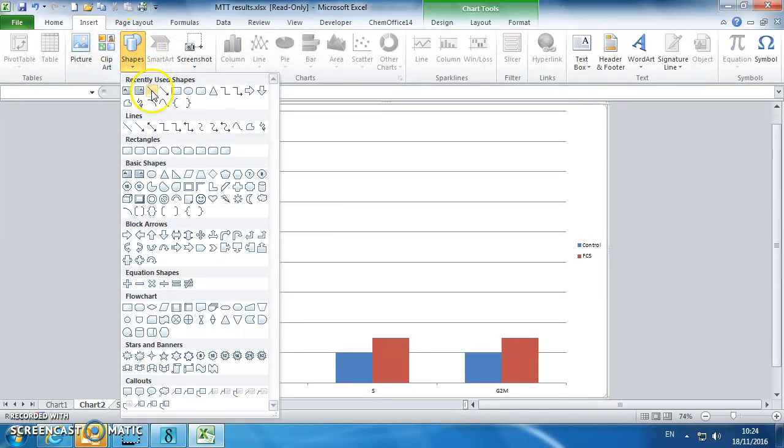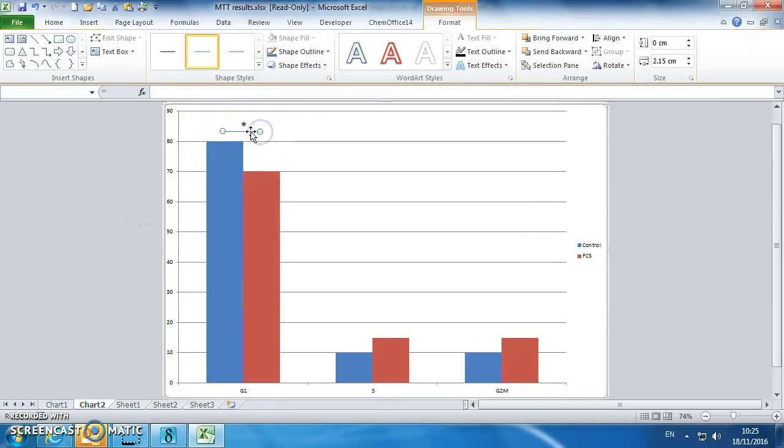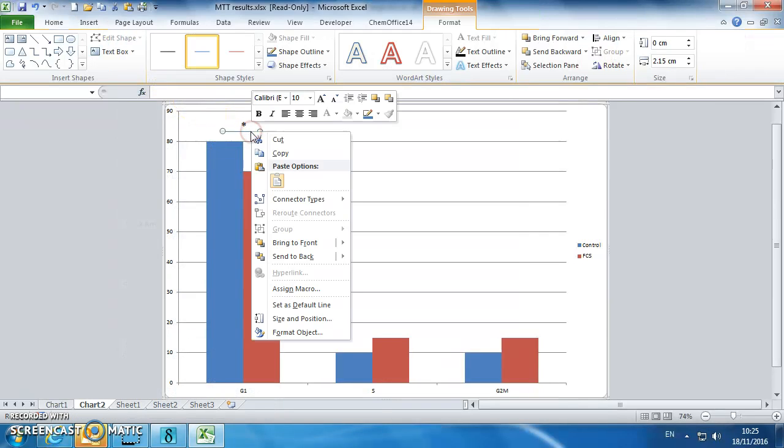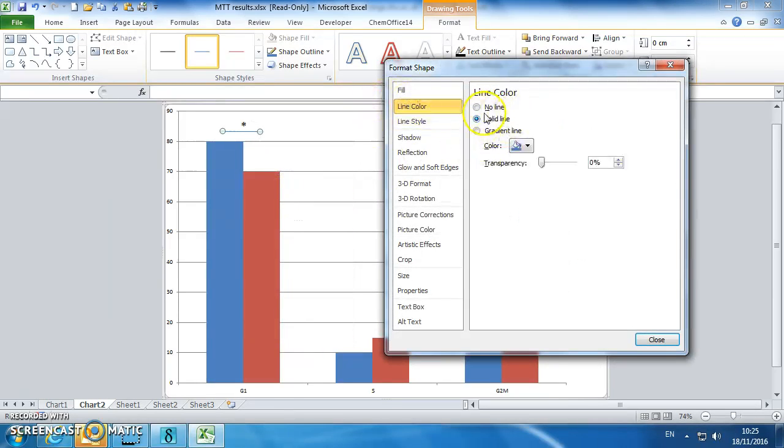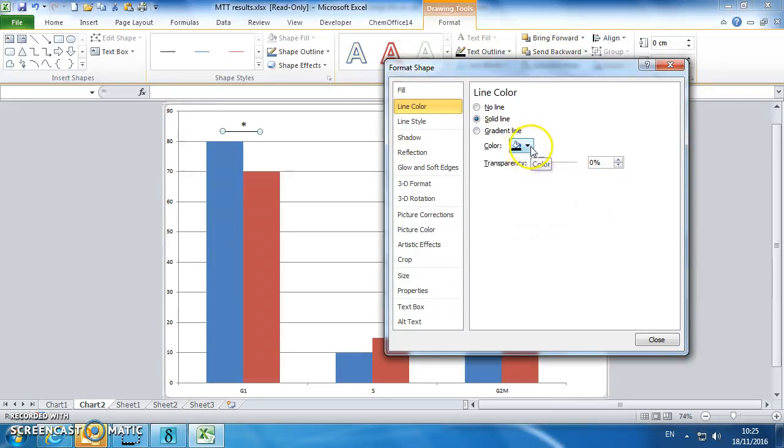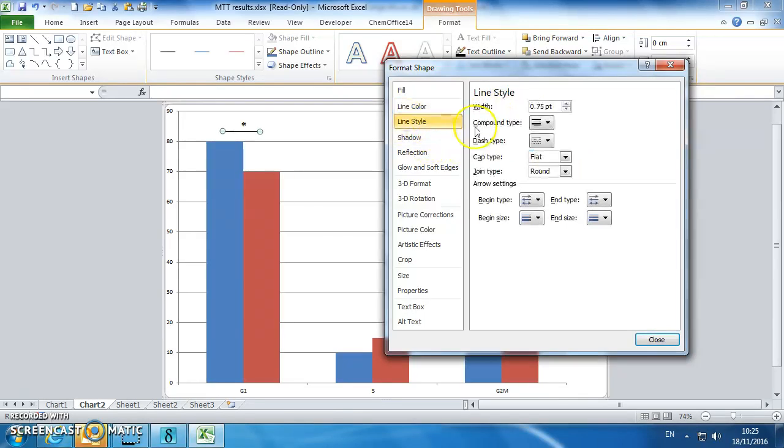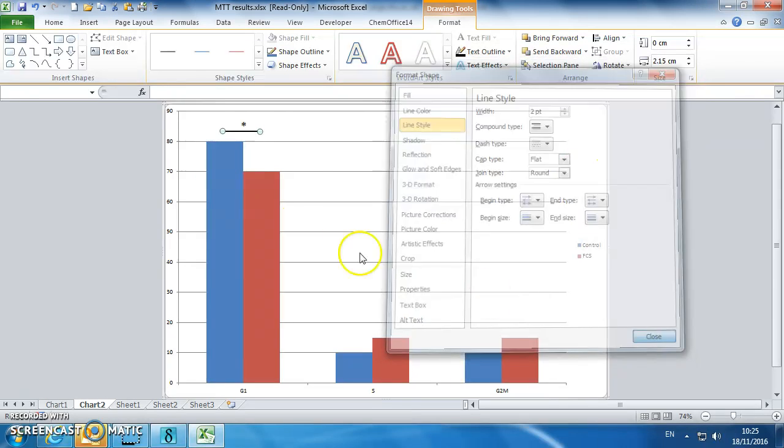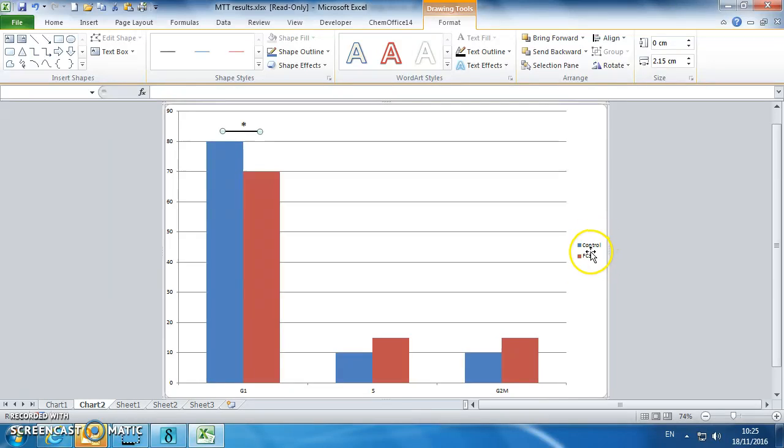Just to be sure what we're talking about, we're saying that that compared to that are significantly different. Let's make it black, solid line, make it nice and thick. So that's telling us that between G1 and your control in your FCS group, you've got a significant difference.